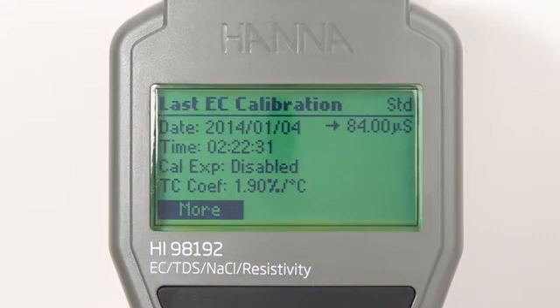The GLP data includes the last calibration date and time, days to expiration when calibration timeout is enabled, calibration points used, and offset.